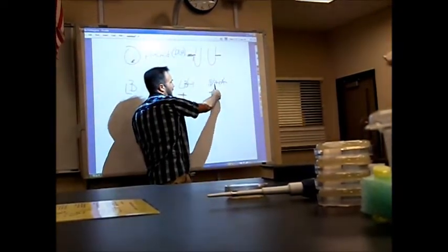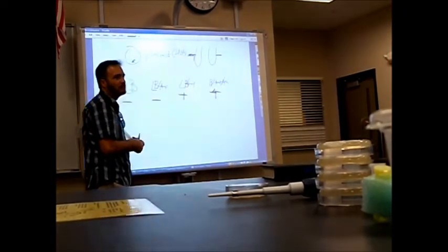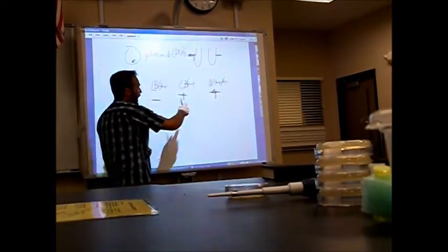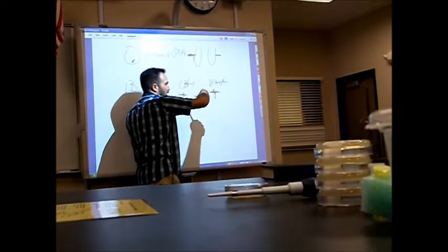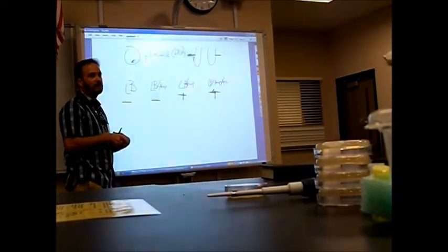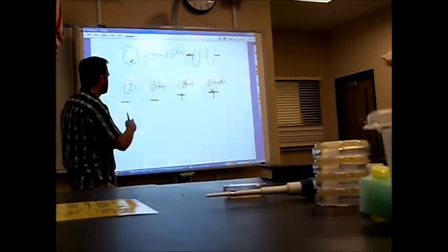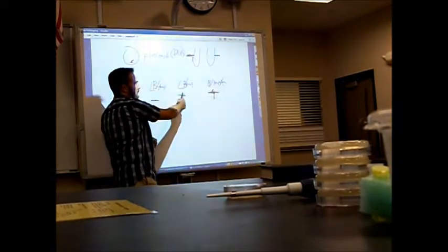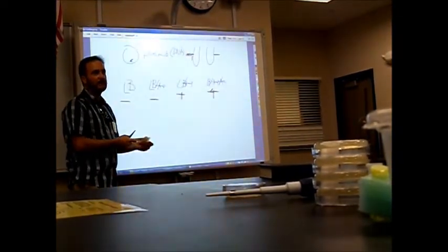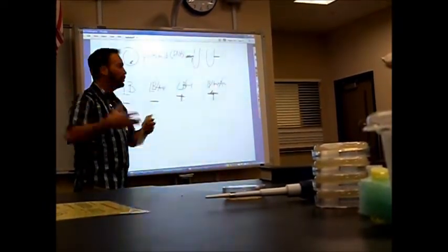How about these guys? These guys got the DNA, and they're trying to grow on food plus poison plus sugar. So how's that going to work? They're going to glow and live. They're going to live, and anybody who didn't get it would die, so you'll see little individual colonies, and because there's arabinose there, the little switch should be turned on and they should glow. Are you all following that? So, they're going to live, they're going to die, they're going to live, but they're not going to glow, and they're going to glow and live. You got it. Now we'll find out tomorrow if it actually worked, right? We'll see. But what you're going to do is set it up today.